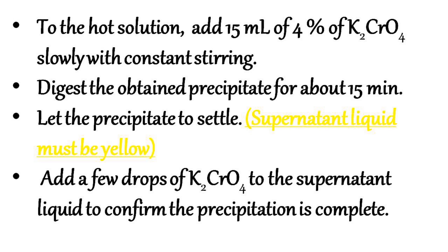Allow the precipitate to settle. The supernatant liquid must be yellow. Add a few drops of potassium chromate to the supernatant liquid along the sides of the beaker to test for completion of precipitation. If you observe any turbidity, the precipitation is incomplete. When there is no turbidity, the precipitation is complete.